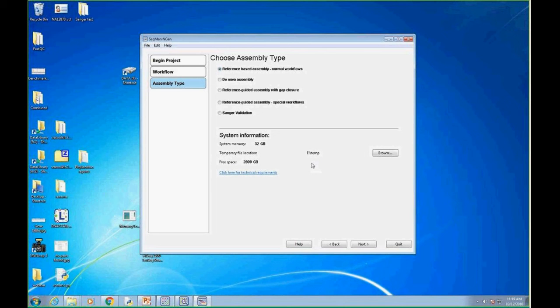So we click next. We can add reference sequences. There's a new button here to download NCBI genomes. So this is another little piece of functionality that can be really handy. And it connects to NCBI, and I can pick the genome by accession numbers, or pick my domain and then browse through genomes and download them locally. So that's a nice handy tool.